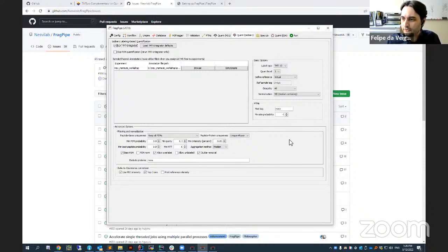Is there a way to add correction factors for TMT quant? No, we don't have that in place because we didn't notice any major changes in the quantification when they were being used.